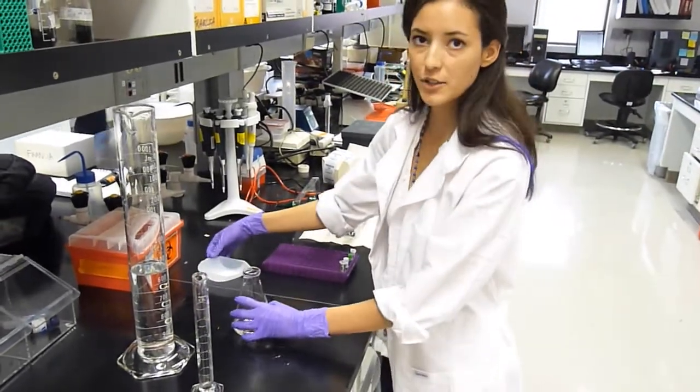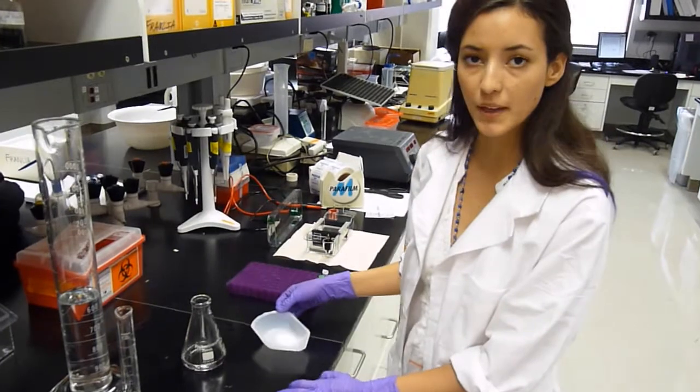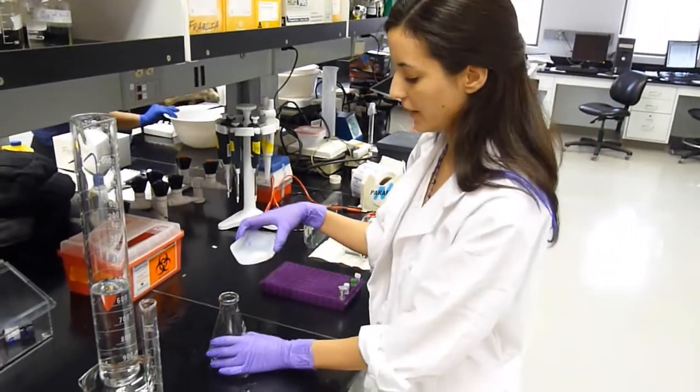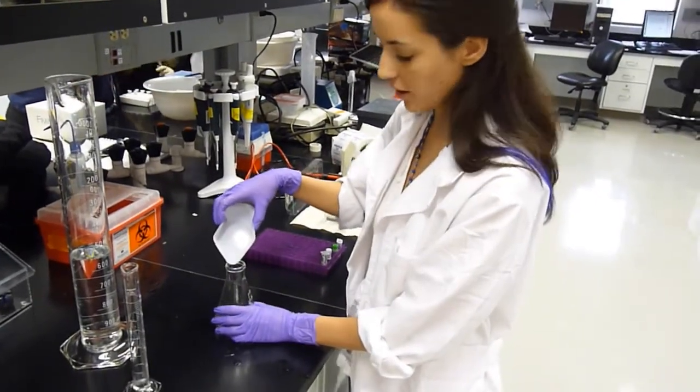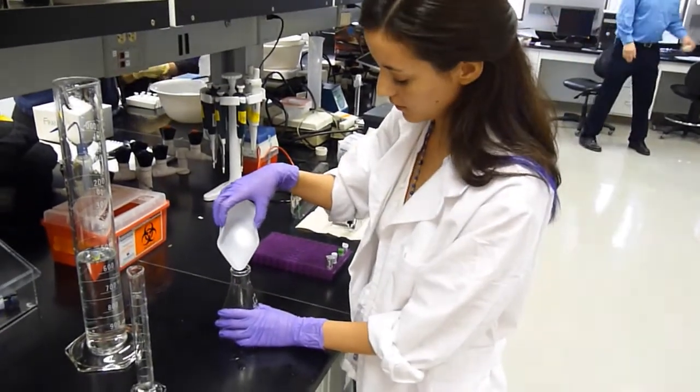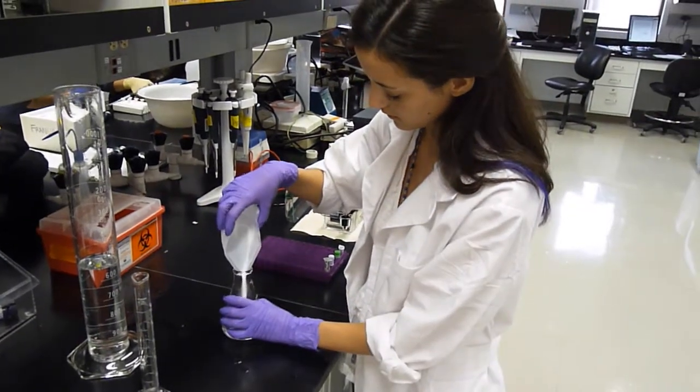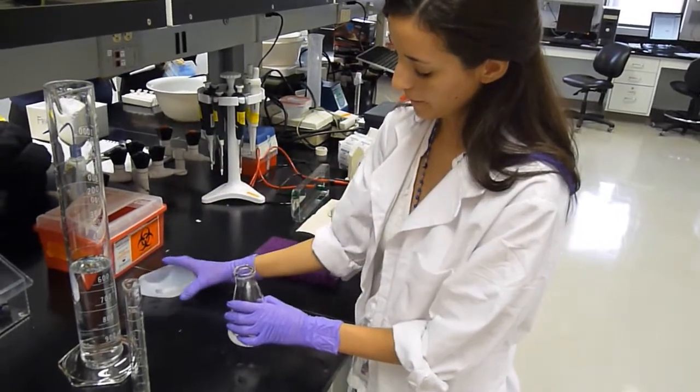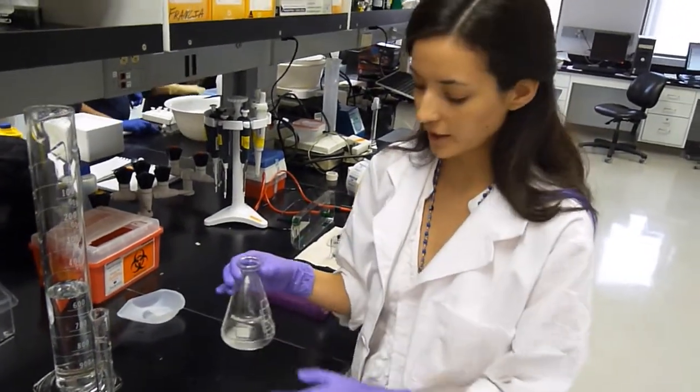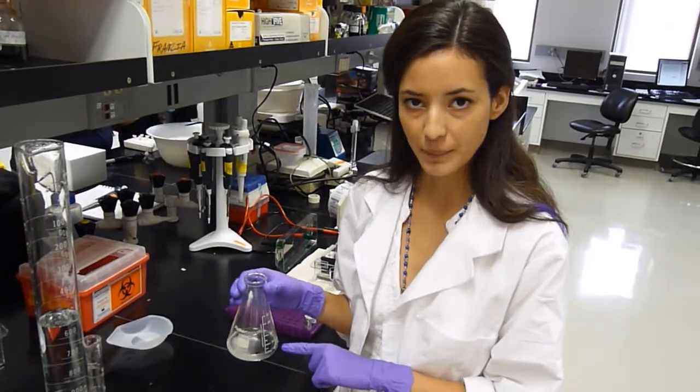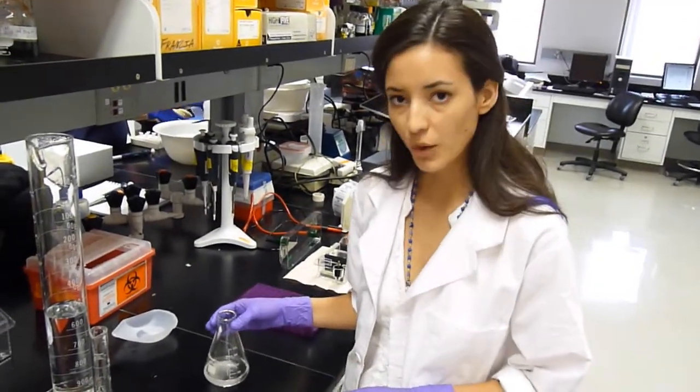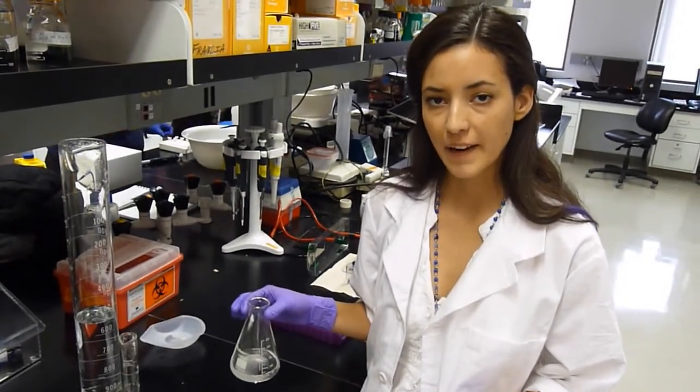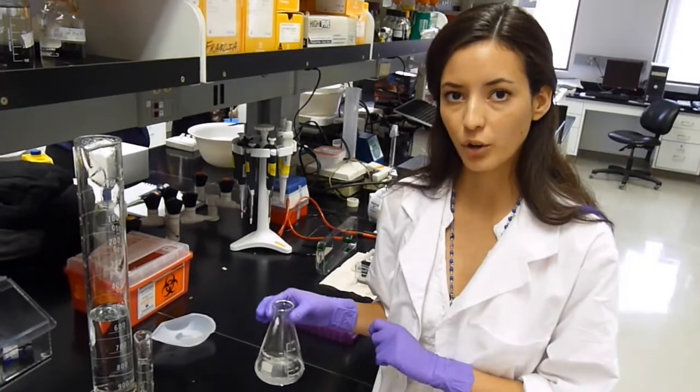We have previously measured out our agarose to 0.5 grams because we're making a 1% agarose gel. And then you just want to pour in the agarose into the Erlenmeyer flask with your 1x TAE solution. A helpful tip that I learned is to not mix this solution before heating it up. Then you want to microwave it in 30 second intervals and be careful to monitor it so that it doesn't boil over.